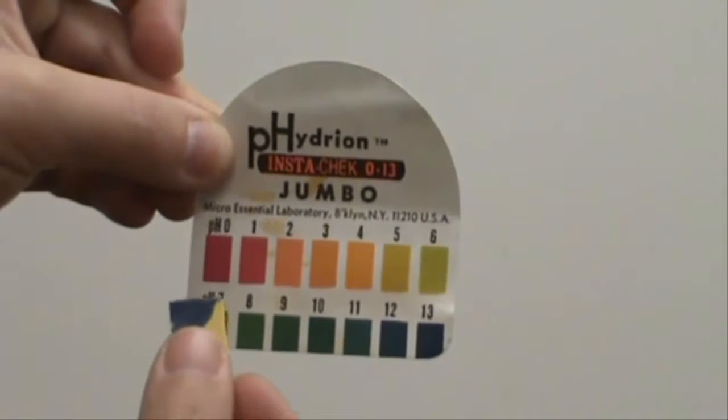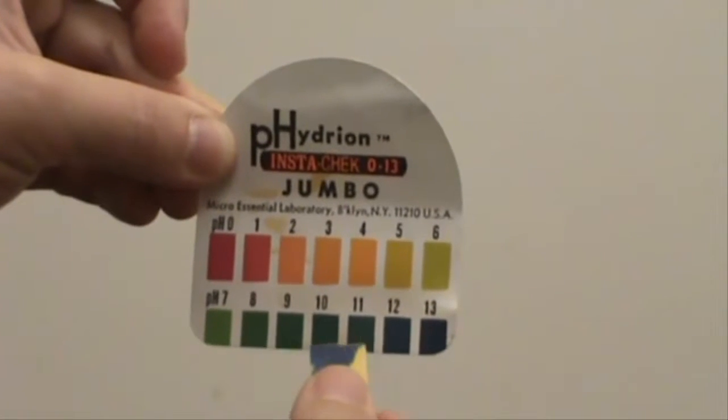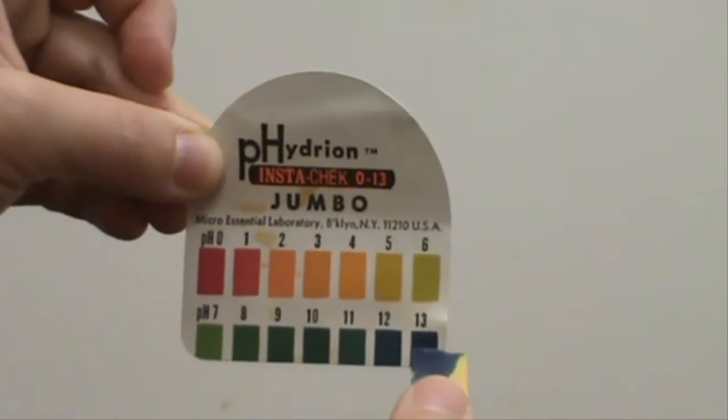Using the color indication paper that comes with the pH paper, try to compare the center of the color change with the paper. It may be difficult to estimate, so use your best judgment. Don't estimate between pH numbers such as 12.5, simply record your best estimate. If you need help with any of the write-up, please speak with your instructor.